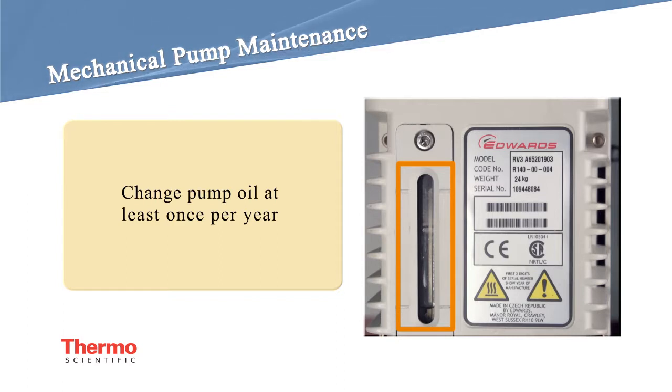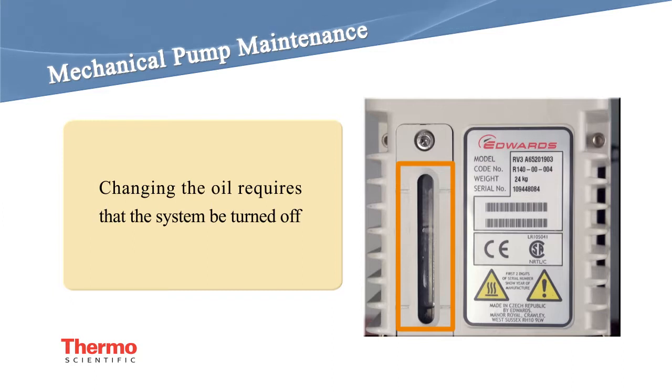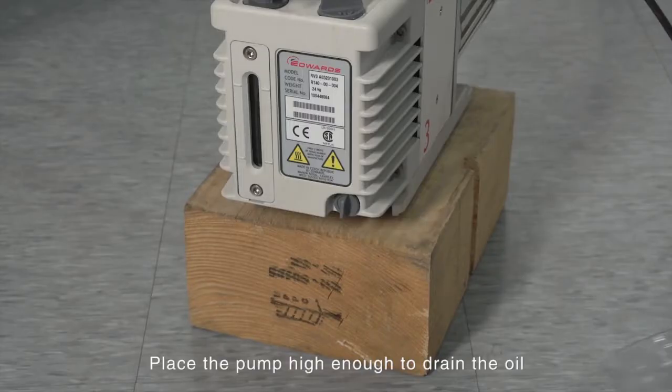System usage dictates how often pump oil needs to be changed. We strongly recommend the oil be changed at least once per year. Changing the oil requires that the system be turned off. Please refer to the video on how to turn the system on or off.